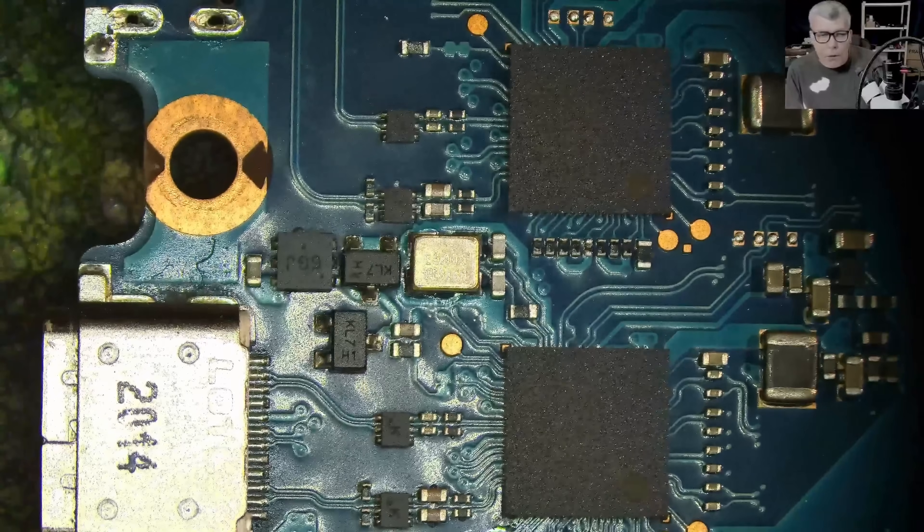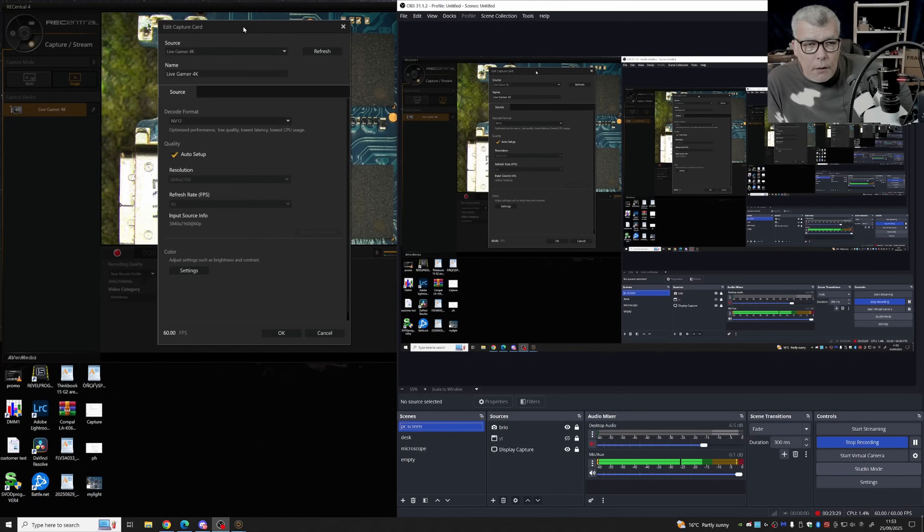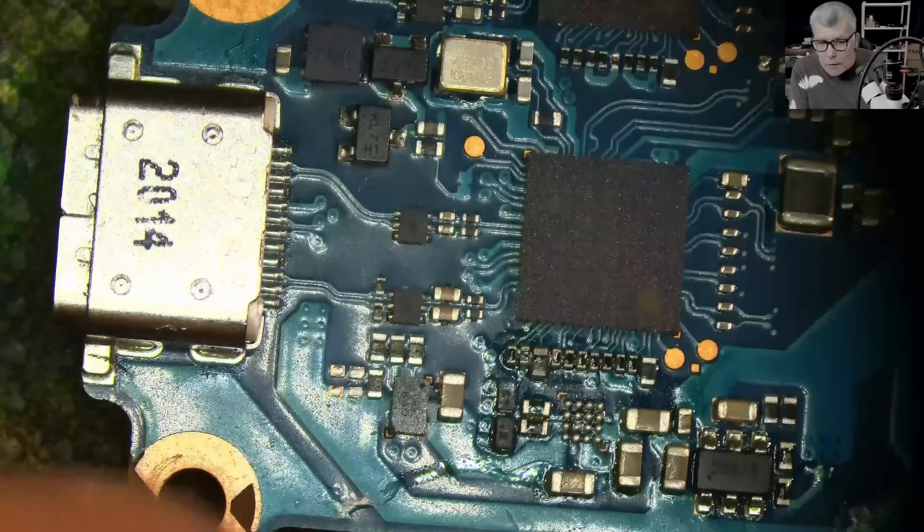Let me verify it's actually 4K. Checking my capture card — the source info reads 4K 60fps. So yes, the camera indeed delivers 4K at 60fps. It looks like 60fps — confirmed.